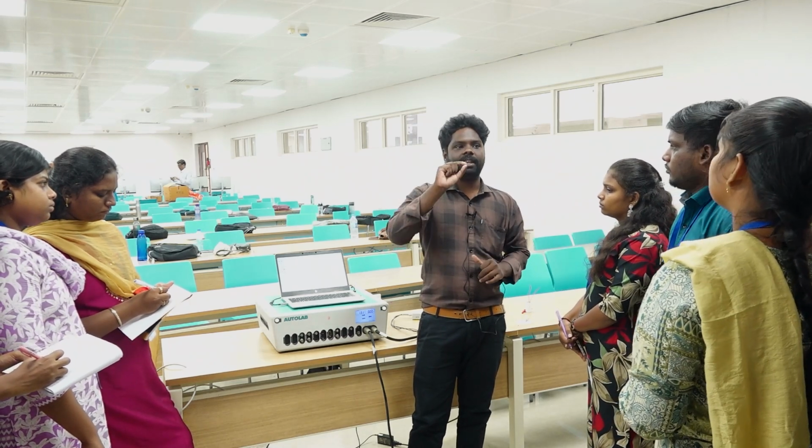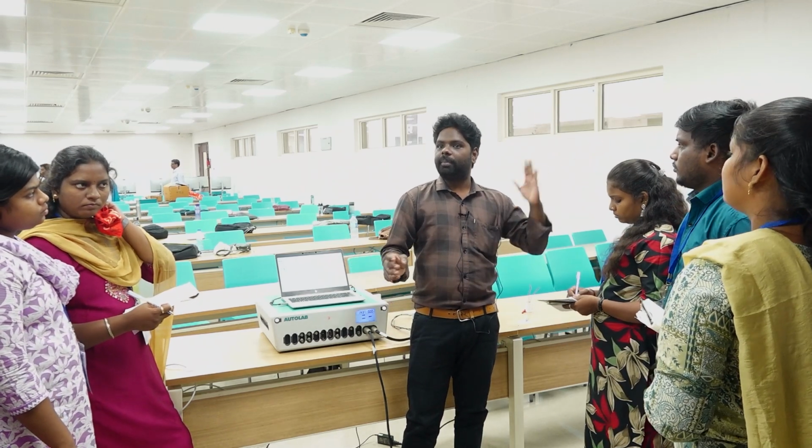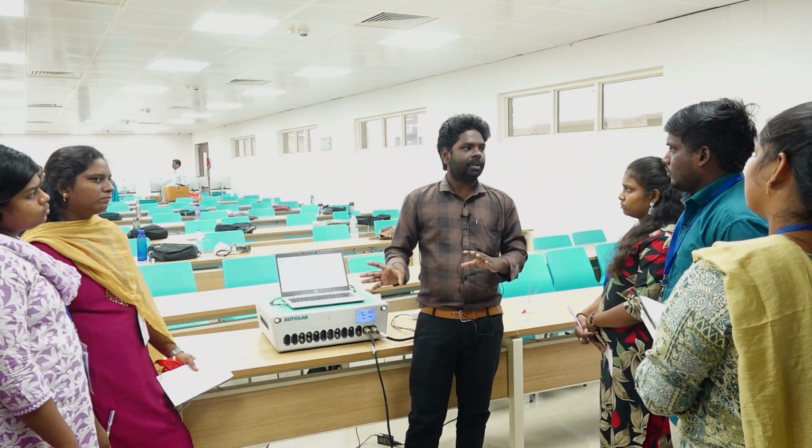In other techniques like CV, we apply either voltage or current. But in EIS, we simply apply a sine wave, frequency only. We sweep from high frequency to low frequency. In this frequency range, we will get the complete behavior of our sample.